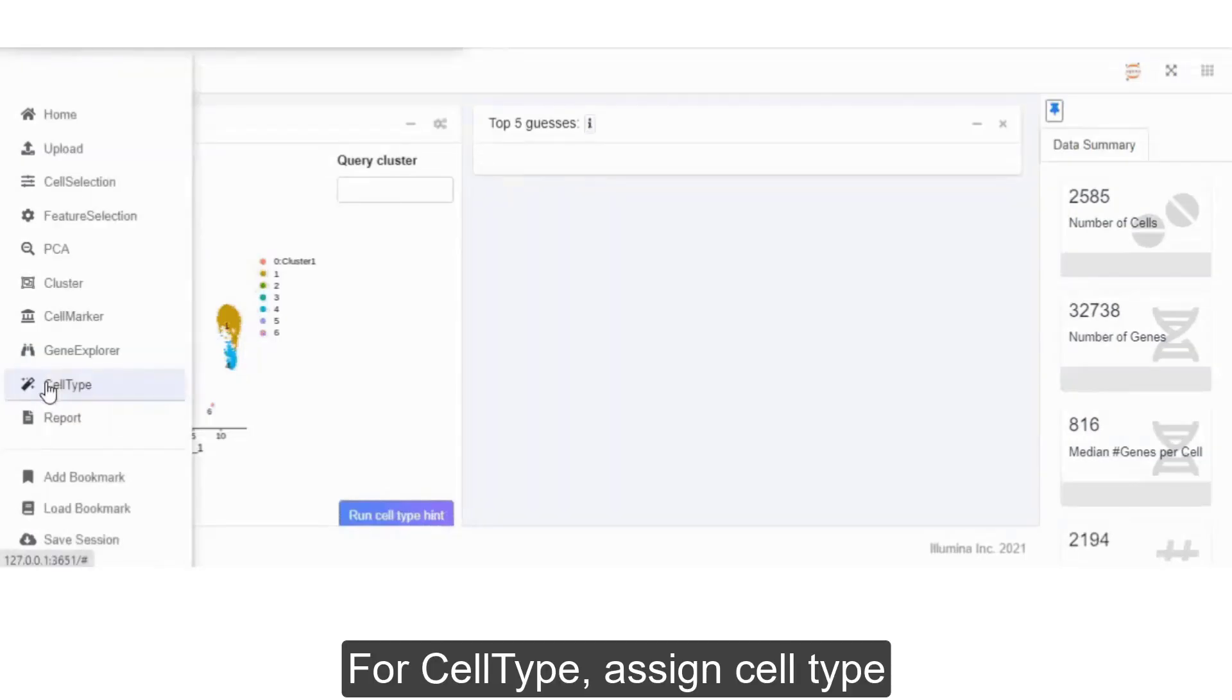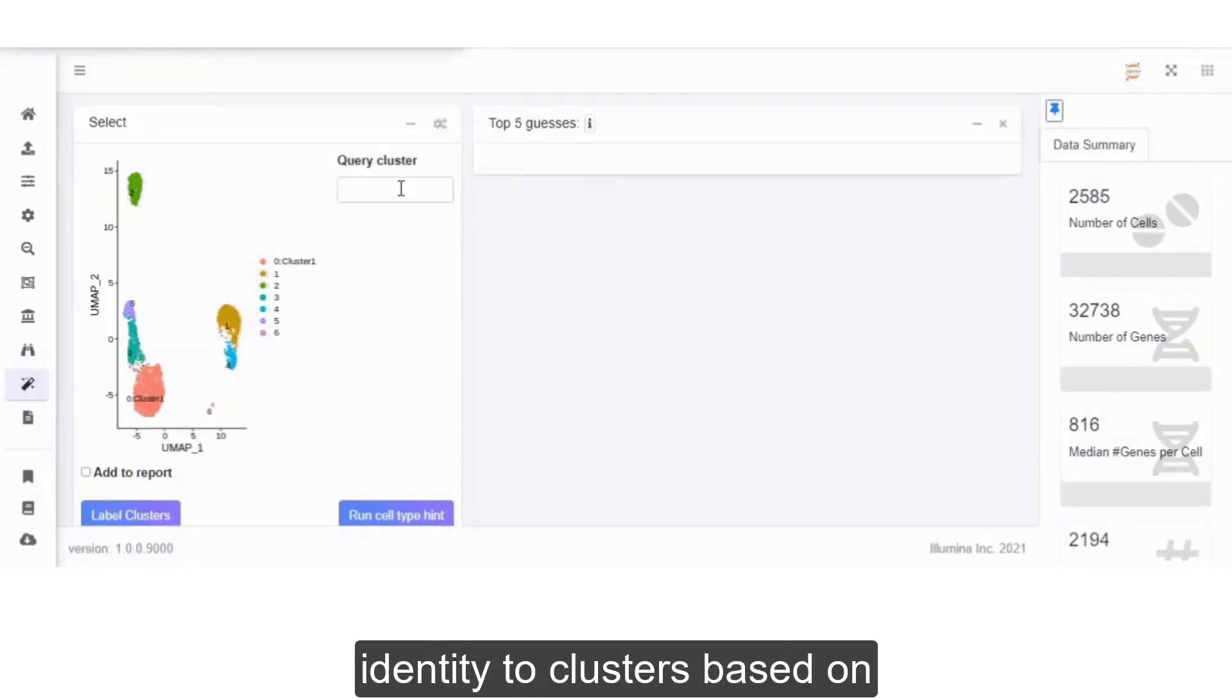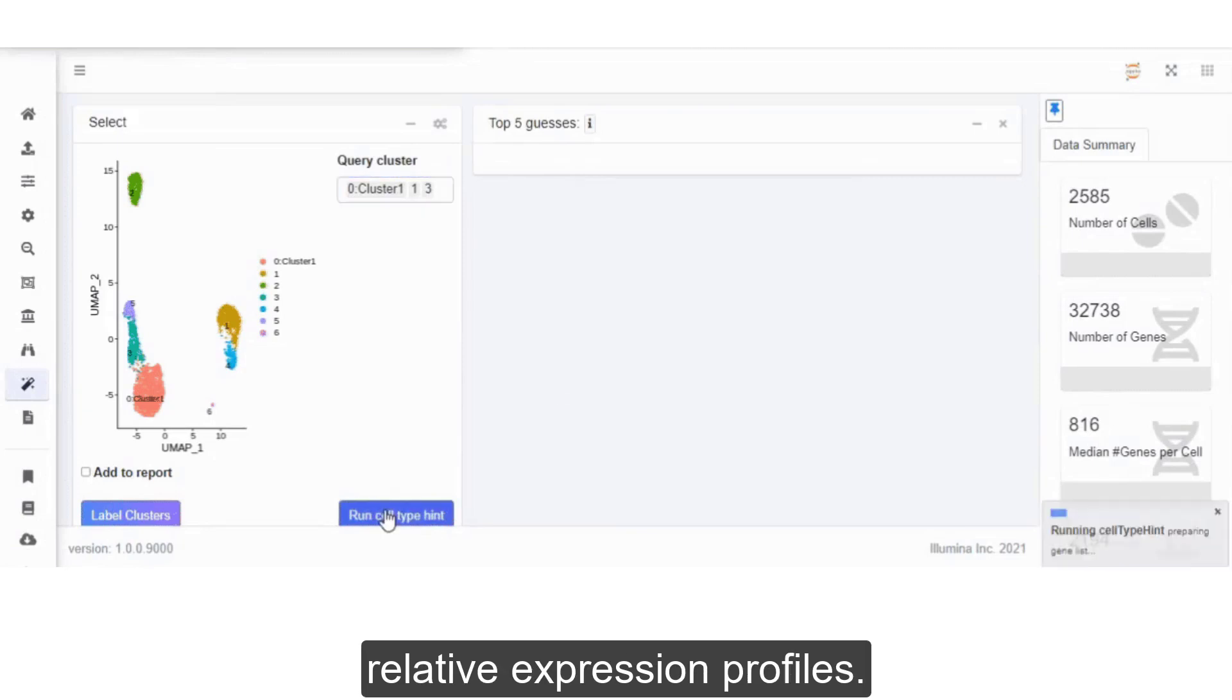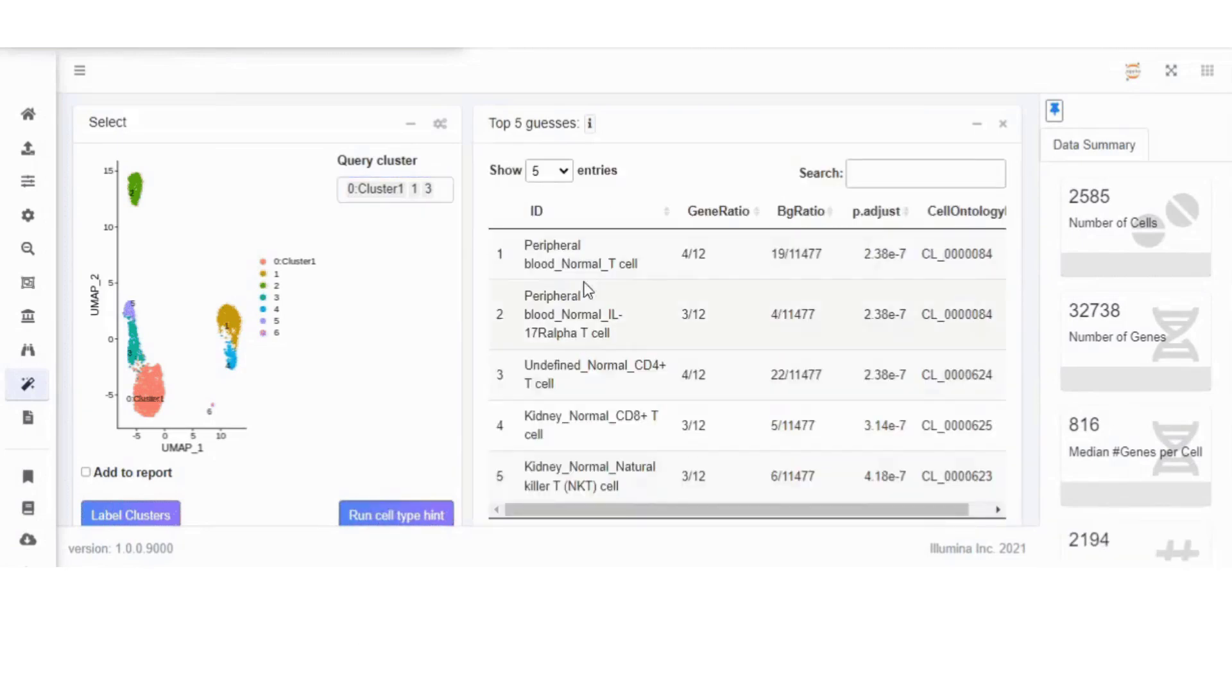For cell type, assign cell type identity to clusters based on relative expression profiles.